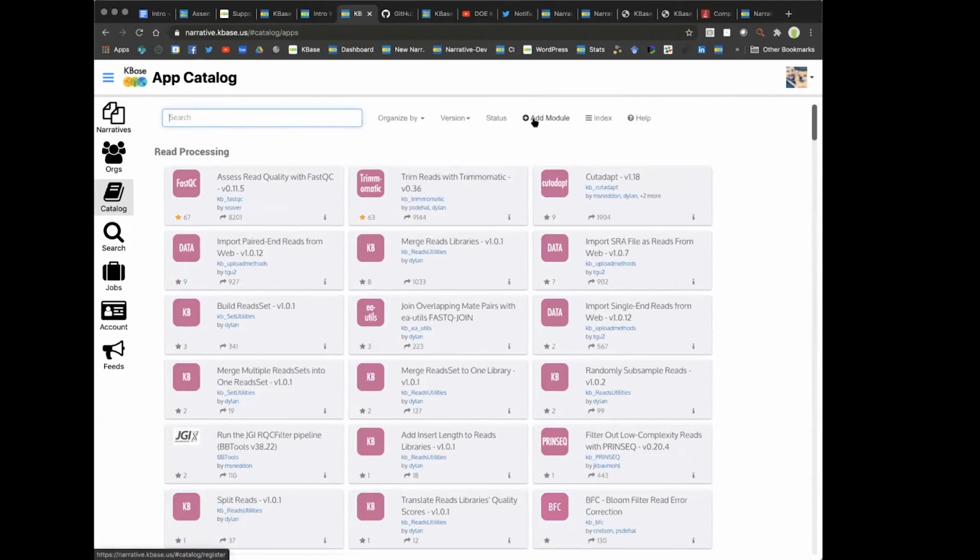It's not quite as easy as just pushing the button, but this does allow bioinformatics software developers to add their tools into the KBase app catalog, use our compute power and data backend and all of that to power their tools. So we're seeing more and more people do just that and add their tools into KBase, which is very exciting.